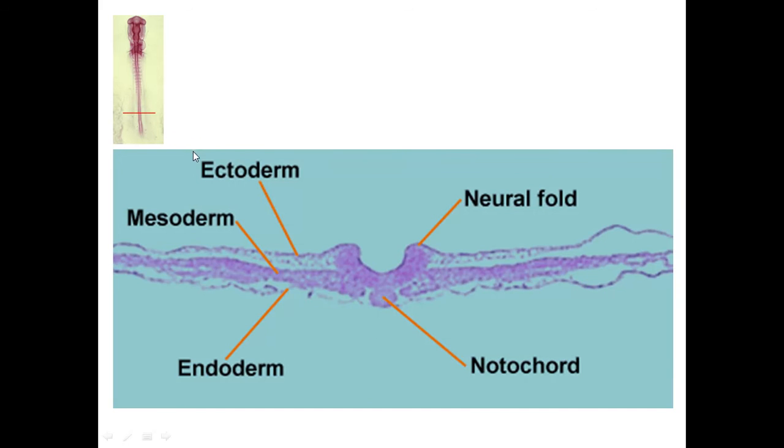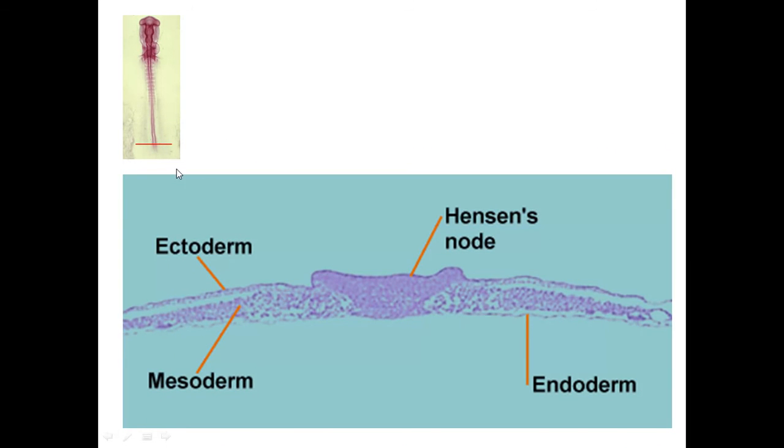Okay, so this one is a cut that is made along the posterior-most region of the animal. Neural folds have not met. Neural tube is not totally closed. Alright, then this one is made on this part, on the corresponding part of the 33-hour chicken embryo.